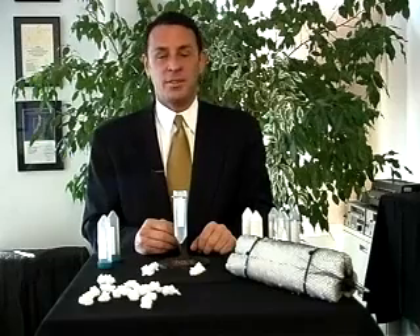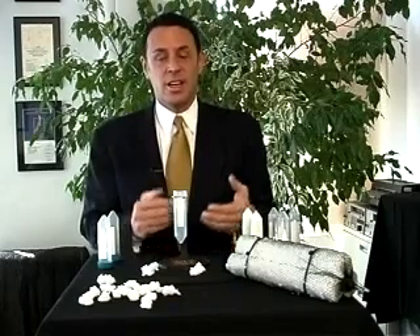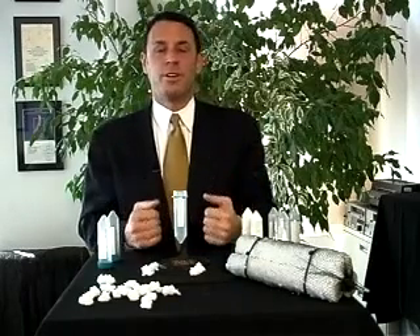you'll be able to see many of the different applications that the Smart Sponge is being used in. Today will be a visual demonstration of how simple and easy we can remove contaminants out of water.